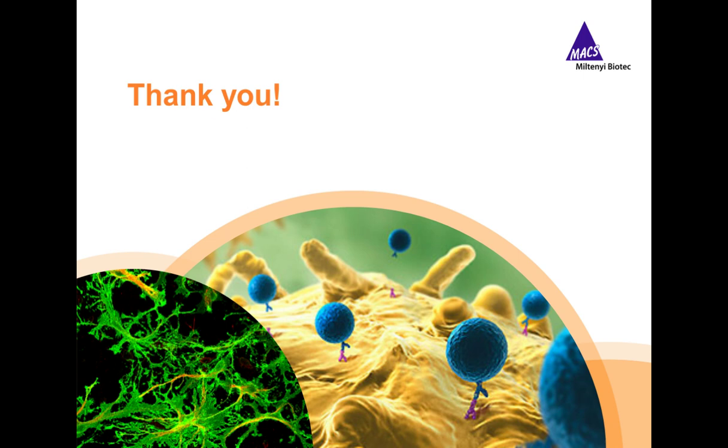Our first question is, how many astrocytes can you acquire from one adult mouse brain, and what is the viability? From one adult mouse brain, we can acquire around 400,000 astrocytes, and the viability is usually 70 to 80%.